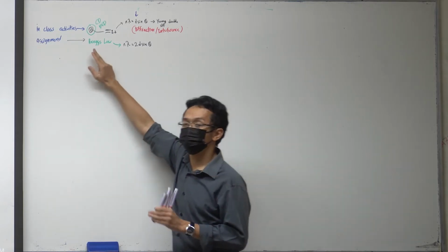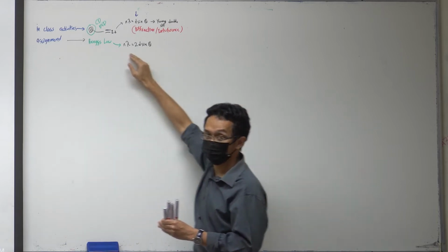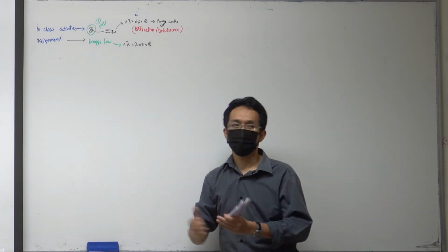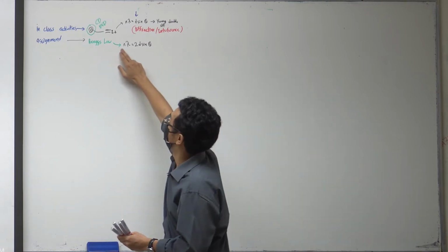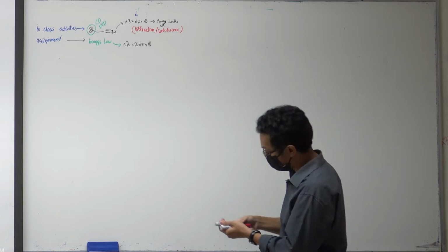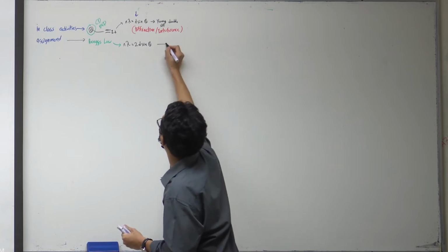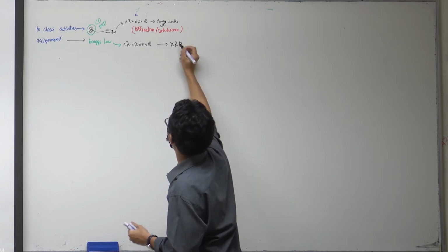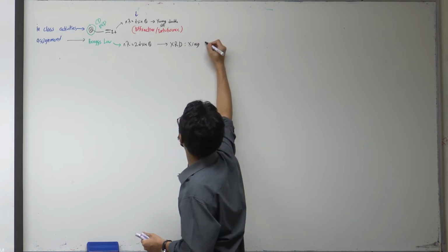So don't just do this assignment for the sake of the assignment, because whatever you do in it will be counted as your reading material. Okay, so I will not touch on this because you have done it. Bragg's law is normally used when people work with XRD. XRD stands for X-ray diffraction.